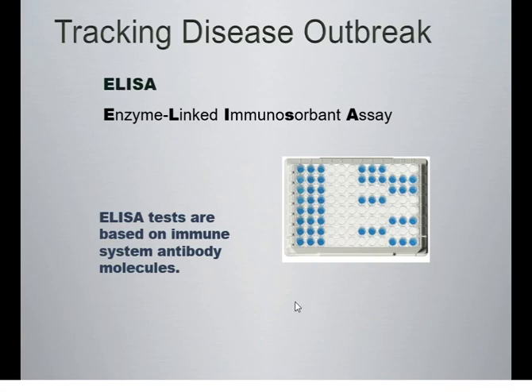So because we're not going to be able to meet together and do this lab as a class, we still want you to understand the theory behind it because this is a really important biotech procedure that is used especially when you need a quick test to verify the presence of a protein.